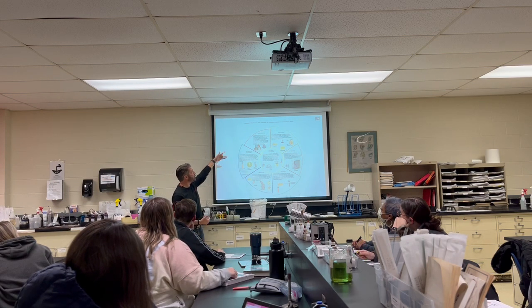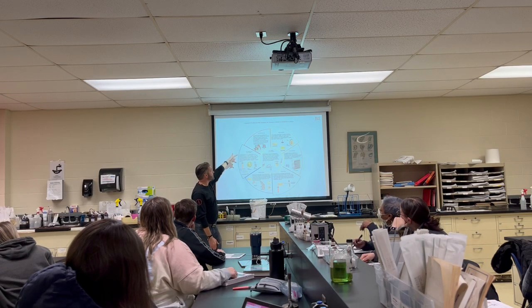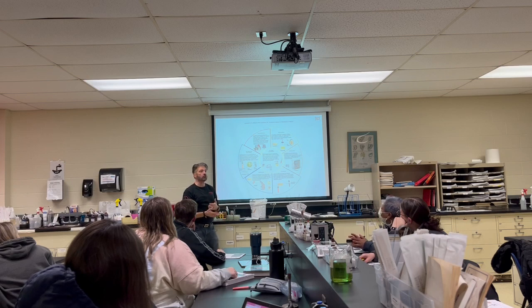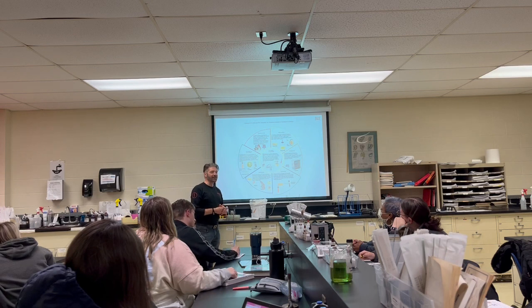So we kind of want to go into grabbing the specimen, we want to incubate it, you know, put it in a nice little warm womb. We have a couple back here, keep it at a certain temperature to grow. And what temperature do you think the incubator's at, roughly? I don't know, Dr. Phil, probably body temperature. Yeah, body temperature, so around 37 degrees. We want to keep it culturally around body temperature.